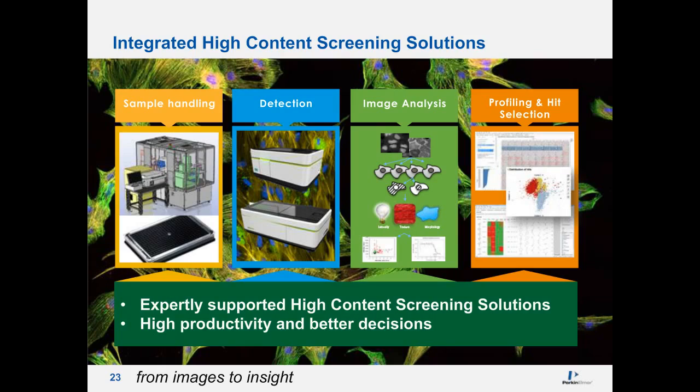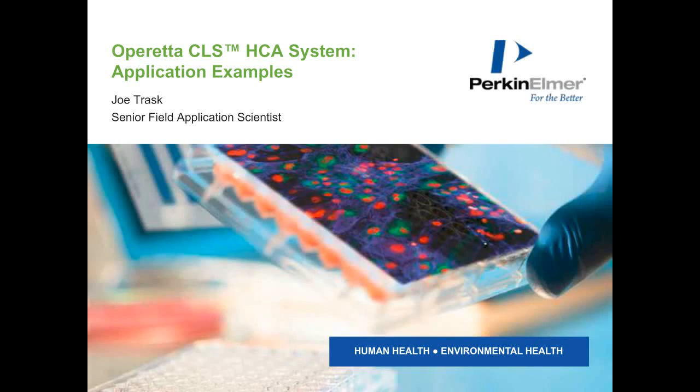Great. Thank you, Christina, for that. And thank you, Jacob, for the introduction. I think that's a great segue into my discussion today, in which I'm going to talk to you about some of the applications that have been run on the Operetta CLS high-content imaging system.